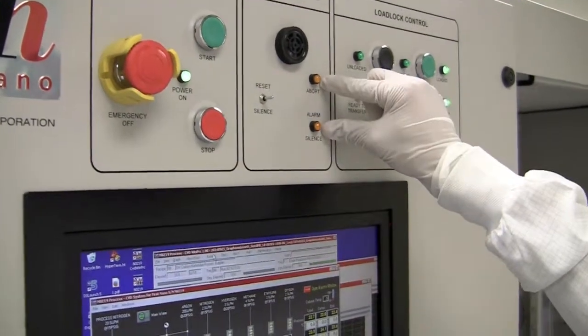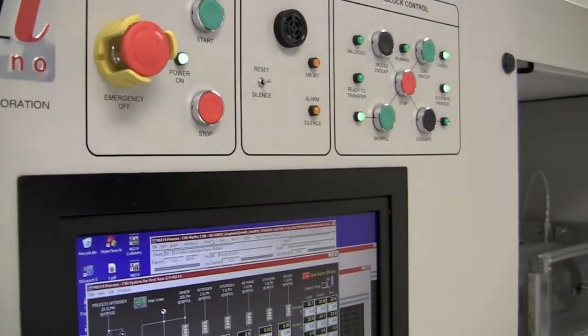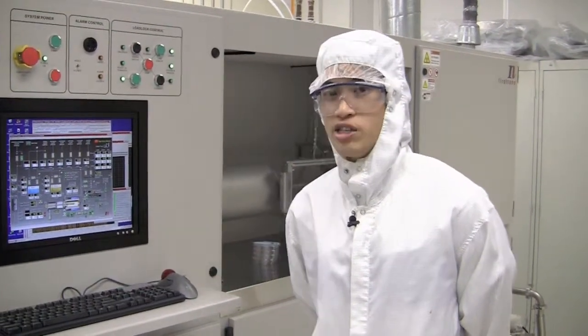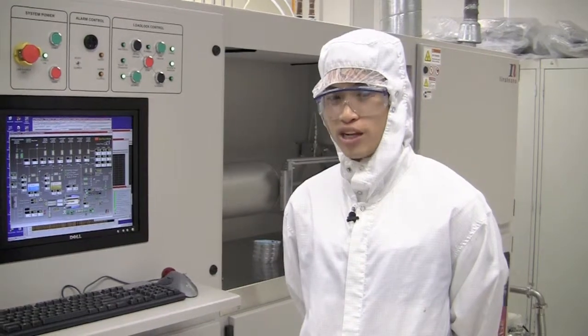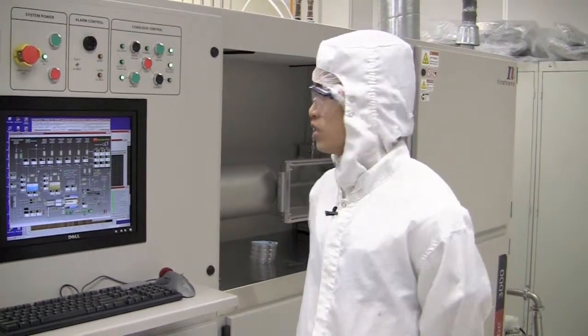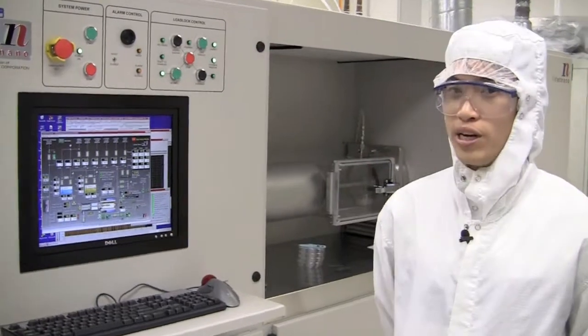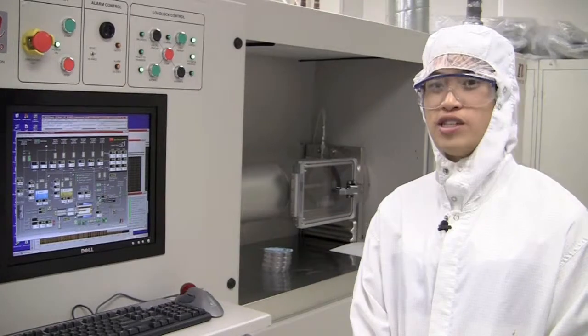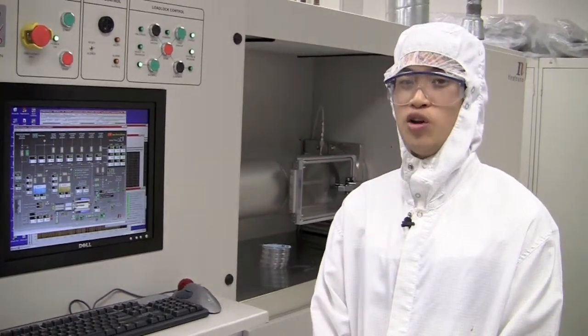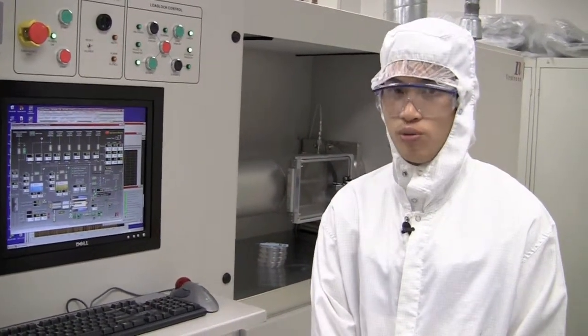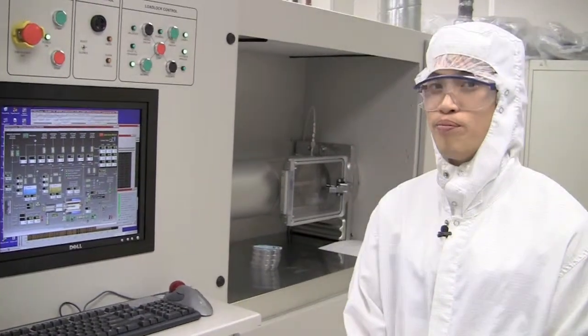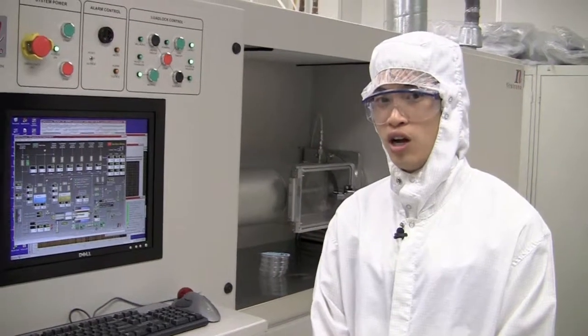After you hit reset to begin the recipe, every recipe has a leak back check stage. This series of pumping down ensures there's no leaks in our system. This is a safety mechanism to ensure no oxygen gets inside our tube and no combustible gases leave the tube. After the pump down stage is over, the recipe will begin and the furnace will begin heating up.